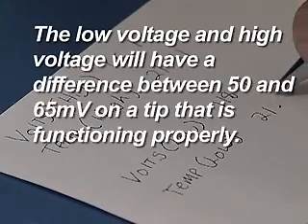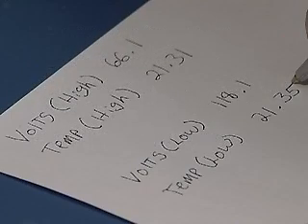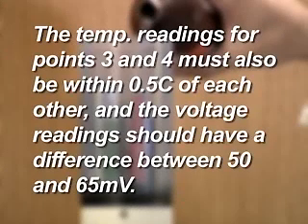The low voltage and high voltage will have a difference between 50 and 65 millivolts on a tip that is functioning properly. This gap will shrink as the sensor tip ages and becomes less sensitive. If it falls outside of the 50 to 65 millivolt range, it's time to replace the tip. If you're performing a three-point calibration, the third point is with the high standard at a temperature close to the expected water temperature. The temperature readings for points 3 and 4 must also be within 0.5 centigrade of each other, and the voltage readings should have a difference between 50 and 65 millivolts. The Ion sensor is now calibrated.